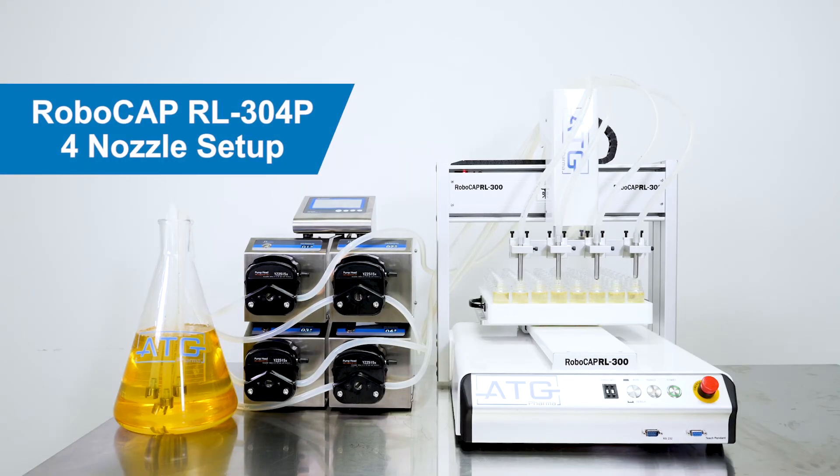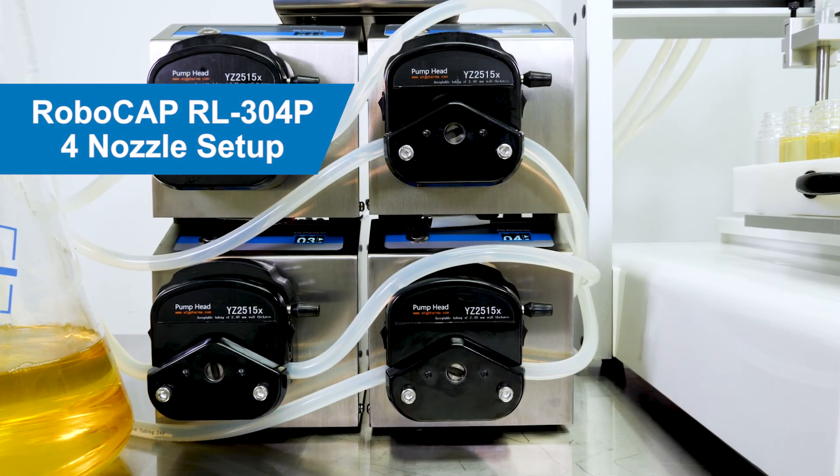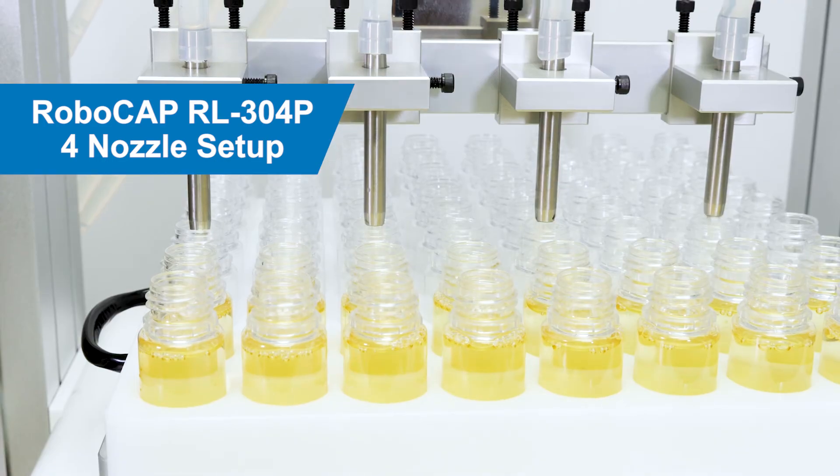As you can see this system is very easy to setup, is very versatile and also scalable to the amount of production outputs that you want to achieve.